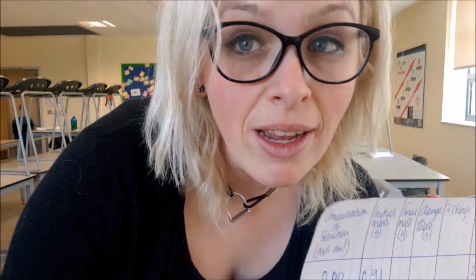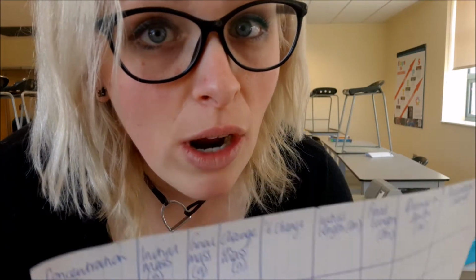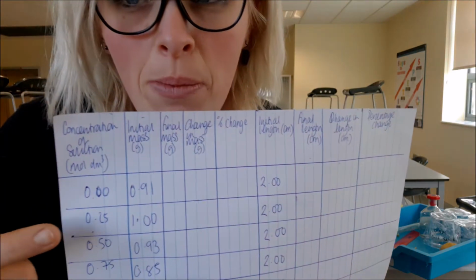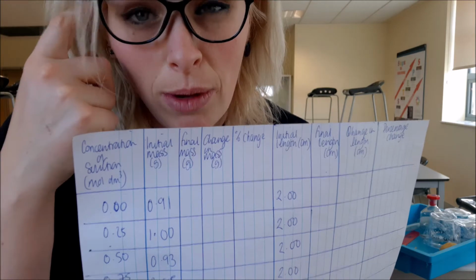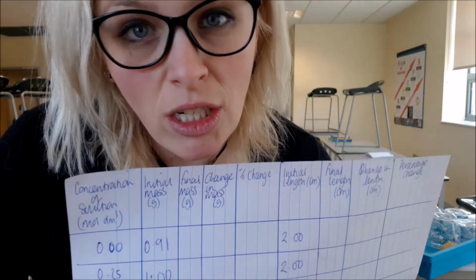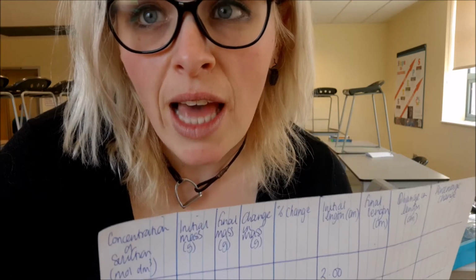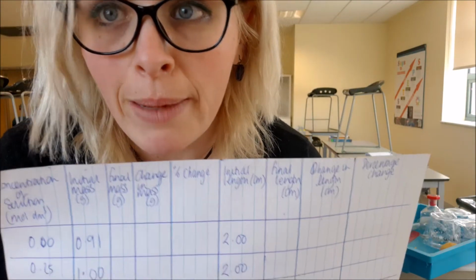And then we should get something that is hypertonic, a very high concentration of salt. And we're assuming that means that the water might move from the cells in the potato out to the hypertonic solution to try and cause an equilibrium, maybe through those membranes. And around the middle here we would have something with a similar concentration of the salts that are in the potato. We might find that as an isotonic solution, we might find no change. We could find no net movement, maybe.